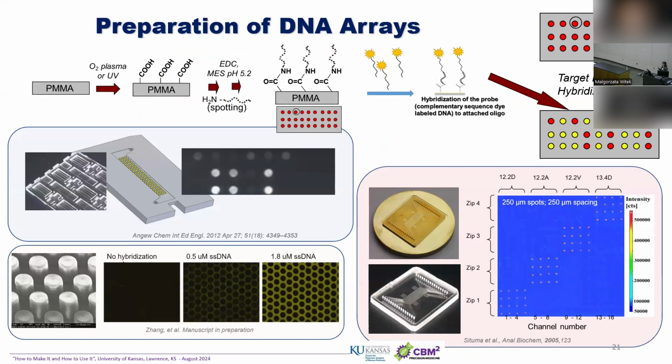So here's the example of creating microarrays using thermoplastics. Truly here you're imaging the molecules that are hybridized to your microarray. You can perform those hybridization type of assays, immunoassays in enclosed structures. This is the device with the posts that give you additional surface area, which will basically extend the dynamic range. You can isolate or you can detect a wider dynamic range of the molecules.